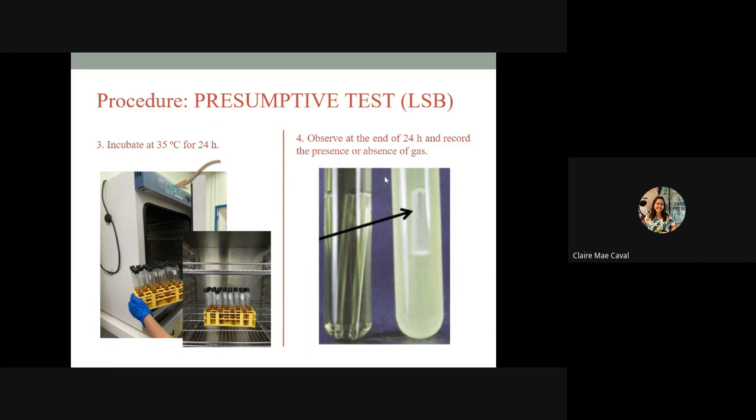Again, yung LSB class, it's presumptive test. It can detect both total and fecal coliform in general kasi nga presumptive pa. This is the positive result for your fecal coliform and total coliform. There is a gas production and also it ferments lactose. For this negative result, i-further incubate pa natin siya for another 24 hours, making it a total of 48 hours. So, this is only for your total coliform class and the presumptive test. Okay? So, again, yung negative result, i-further incubate natin for another 24 hours.